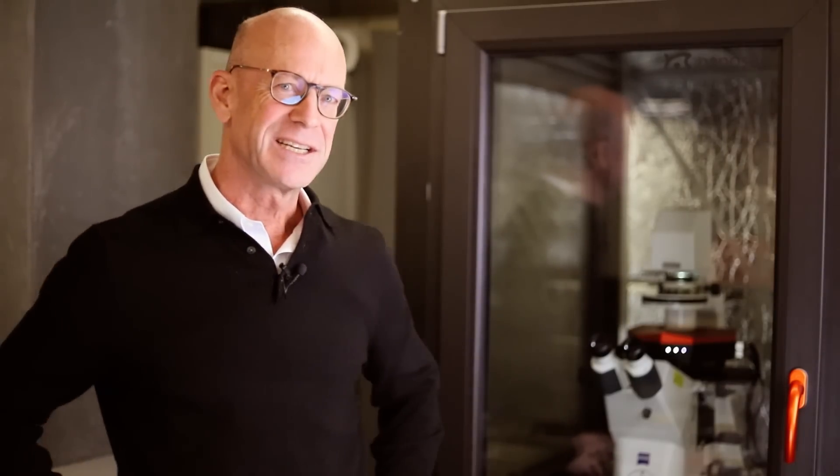And now let's ask Christian Bippes, the product manager, what makes this product really interesting. So this instrument indeed has a number of very unique and very special features. And I just want to mention a few of them that I personally like the most.